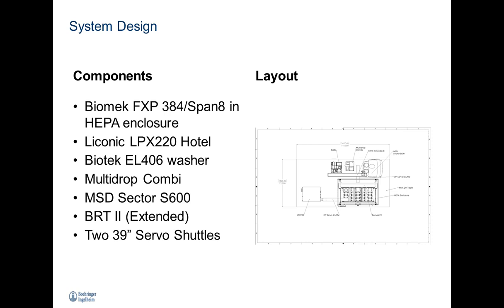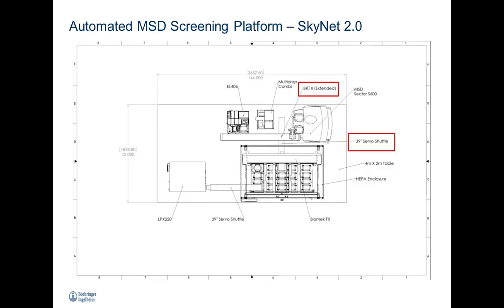We have a BERT2 extended range plate handler and two 39-inch servo shuttles. And this is the overall layout of our platform.